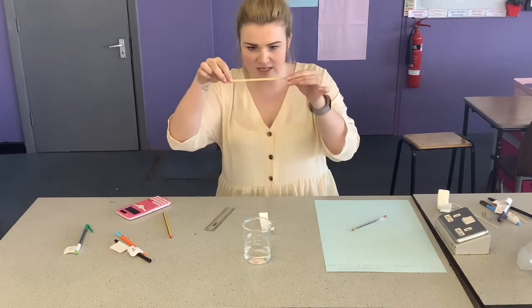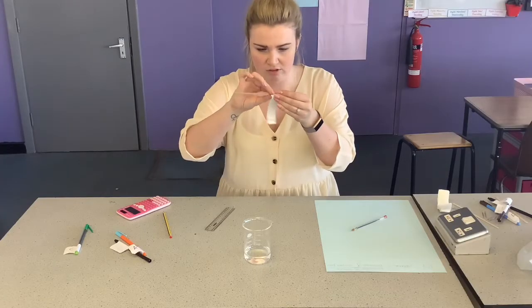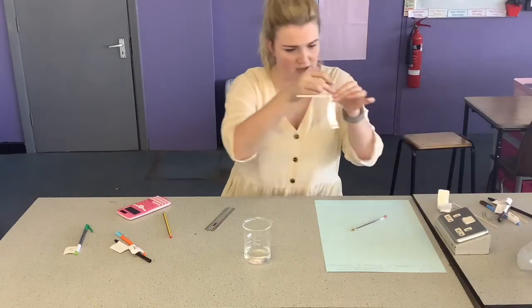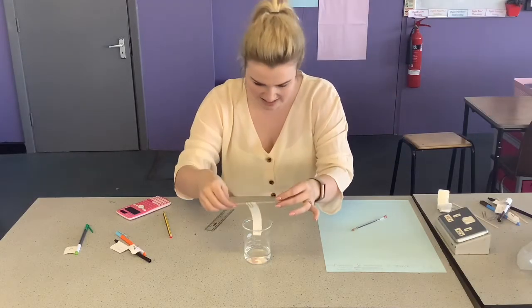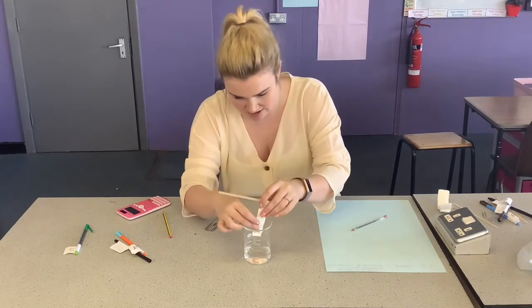Then using these splints that we have in school, fold it over twice and make sure that you secure it with a paper clip. Then I'm going to place it in my water so that my pencil line is just at the tip of the water.